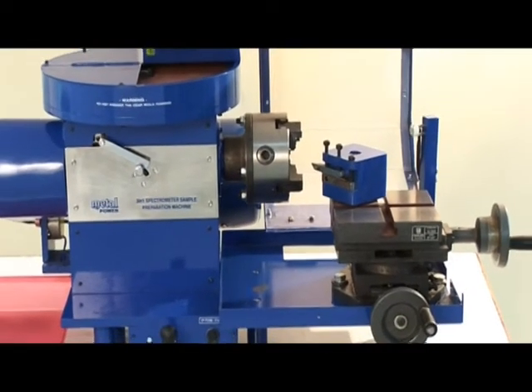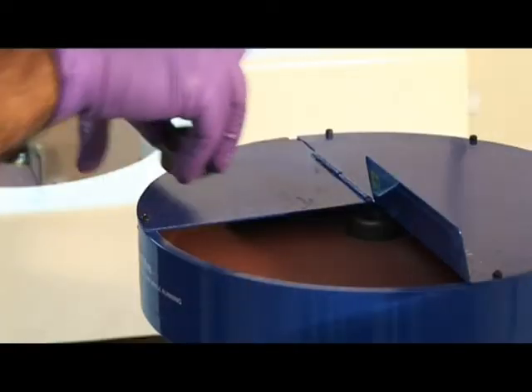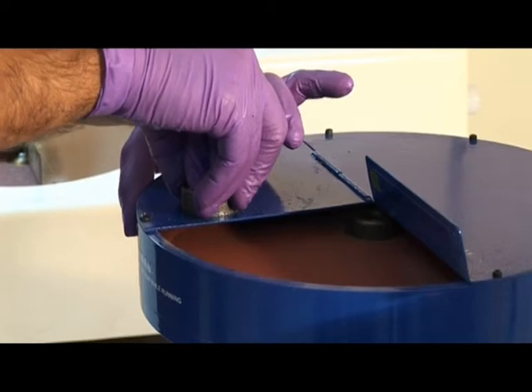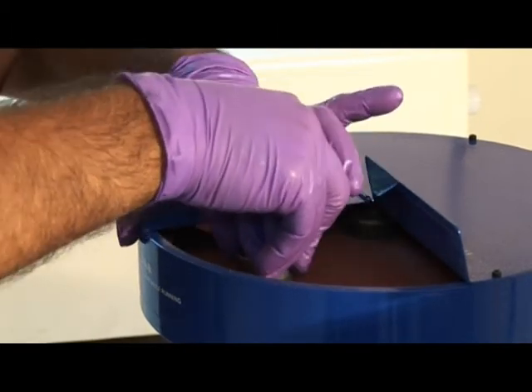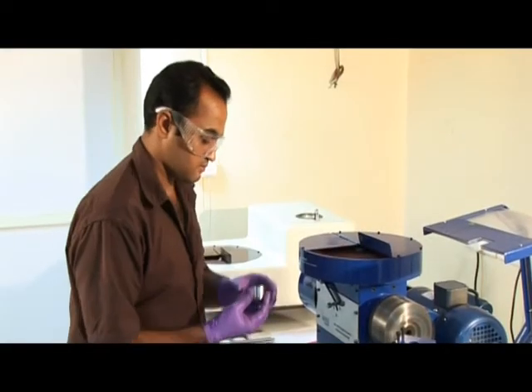The 3-in-1 sample preparation machine is simple to use. The steel sample to be ground is firmly held flat by hand to ensure a flat surface. The sample is now ready for analysis.